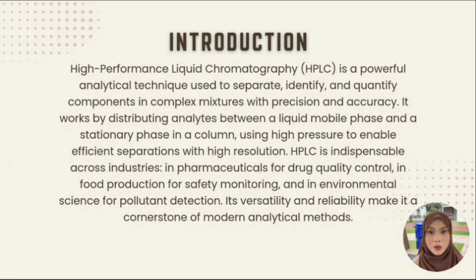HPLC is widely used across industries. In pharmaceutical, it ensures the quality and consistency of drug. In food production, it monitors safety and quality. And in environmental science, it helps detect pollution with remarkable sensitivity. High-performance liquid chromatography is a cornerstone of modern analytical method. Its precision and versatility make it indispensable in research, quality control, and diagnostics.